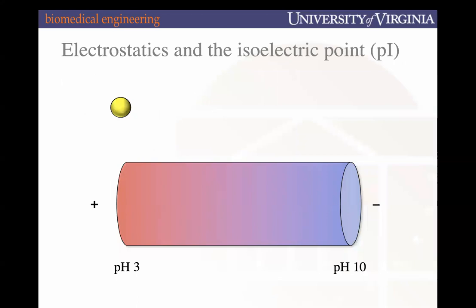I'm sure everyone is intimately familiar with this slide now: every protein has an isoelectric point at which it reaches electrostatic equilibrium. We can also separate proteins, as SDS-PAGE did by size, exclusively by their charge. In class, we talked about this as a hypothetical situation where you have a tube with a spectrum of pHs with your single protein sample.